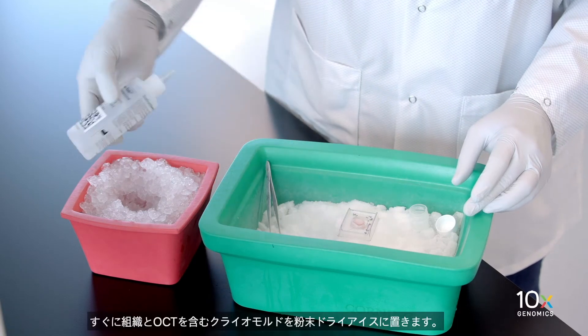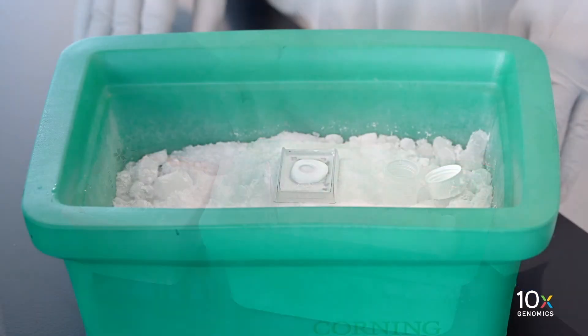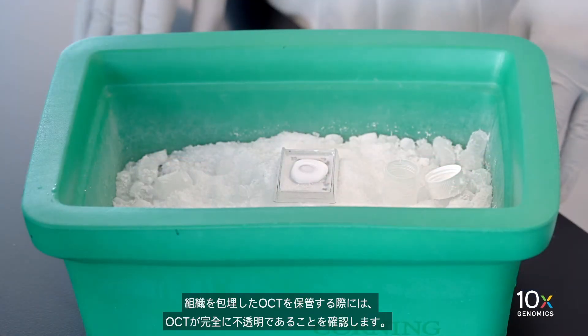Immediately place the cryo mold containing tissue and OCT in powdered dry ice. The OCT should be completely opaque prior to storage of the OCT embedded tissue.